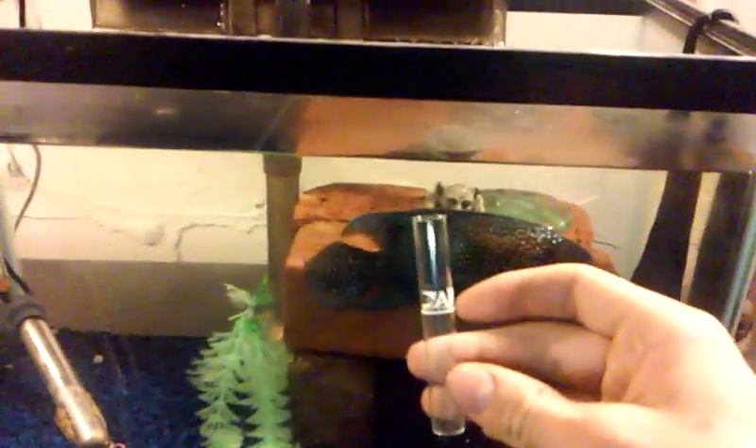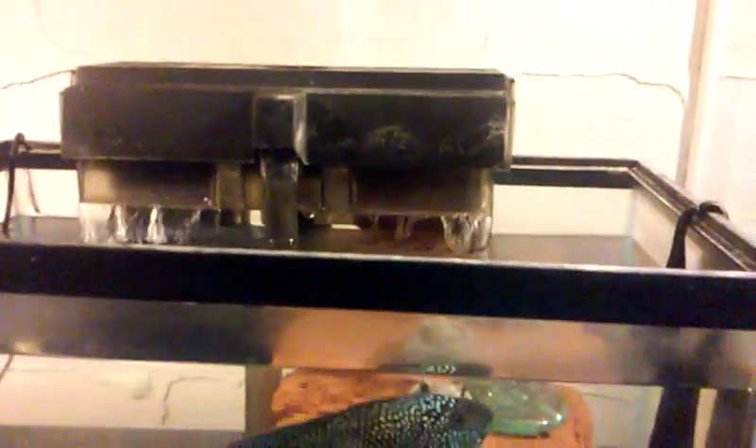First I'm going to take my test tube and rinse it out in the aquarium a few times. Fill it up to the line. I'm going to rinse out my cap.